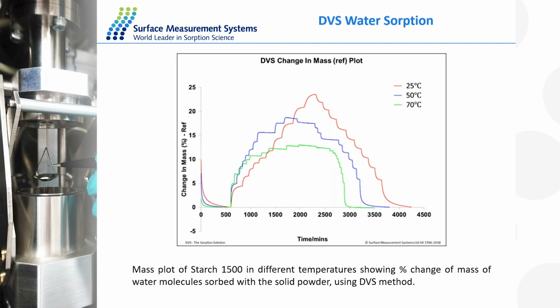in number, even very early at maybe 500 or 600, or 700. One of the early parts in the 70-degree curve is clearly dropping. And later on, near the summits of both the 50 and the 70, they are clearly dropping. And what is going on there?